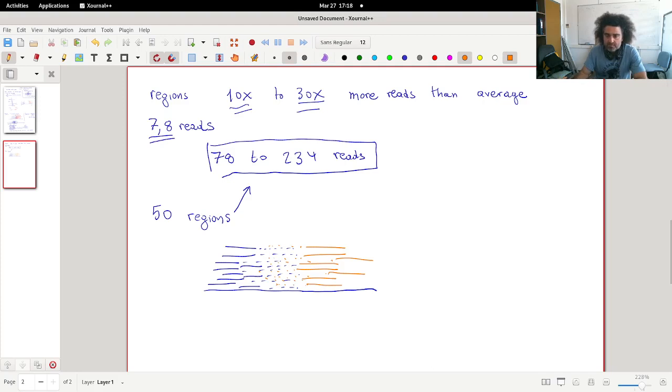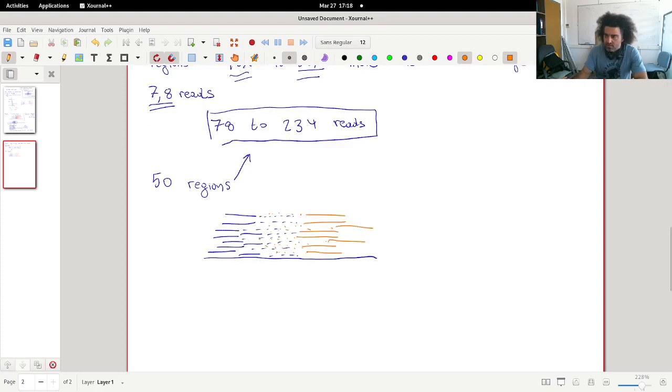And so what we will do now is the following. We will see separately the reads from the plus strand and the minus strand. Now the reads from the plus strand have this location, so the average, now I'm not very sure from the manual, but maybe it's not so important which part of this read we take. We might take the middle, or we might take the beginning or the end. Let's say that we take the beginning.